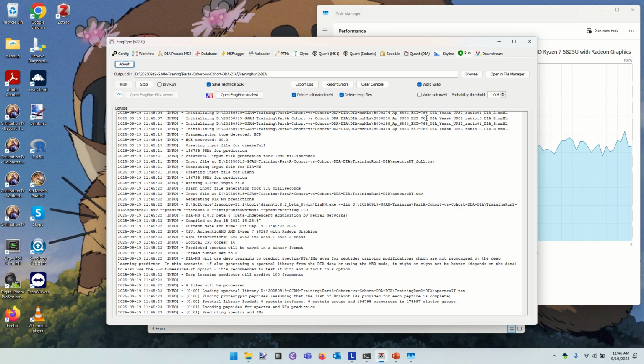So we do 30 different MS-MS scans in each DIA cycle, 30 different windows, which means we're getting 10 measurements within 30 seconds for a given peptide. That is a lot, yeah. That was our goal.